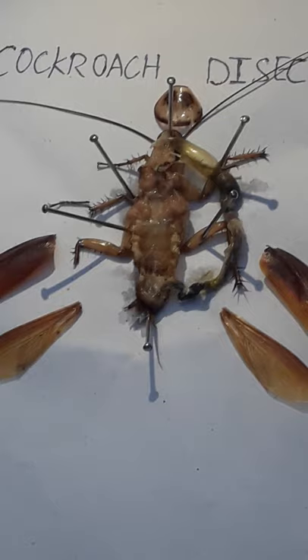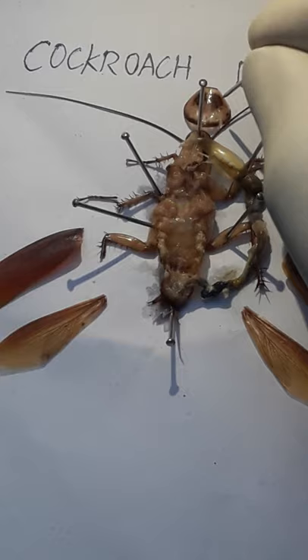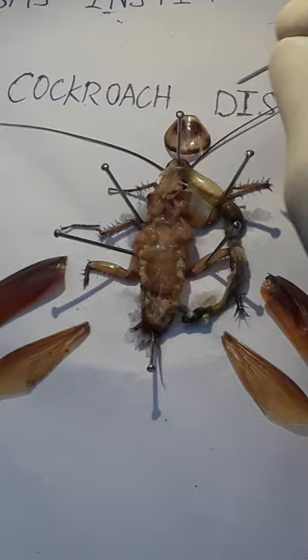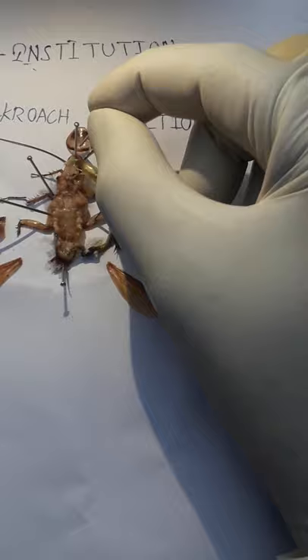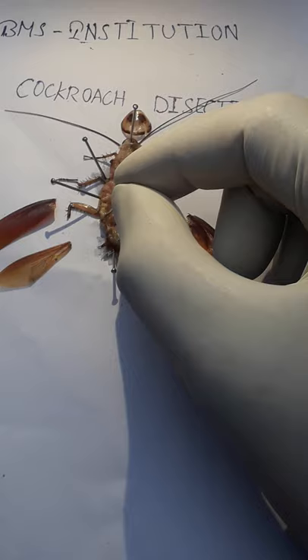Come to the topic — we remove this element. The element is covered with the help of a powerful coat, and this one protects the head and thoracic cavity-like structures. We have successfully removed this and can now see the inside of the digestive system.